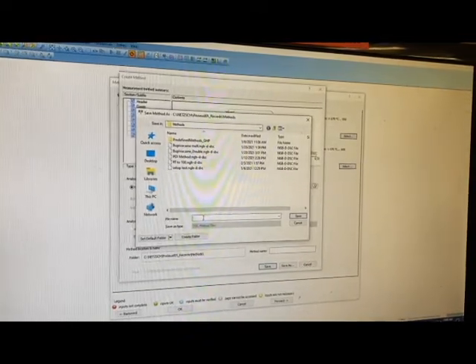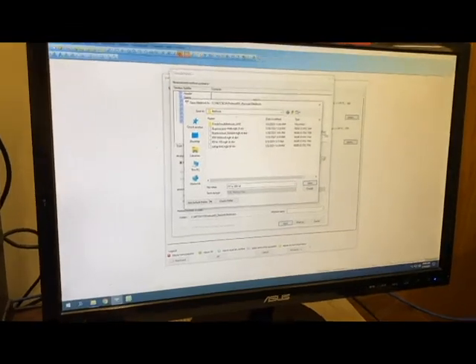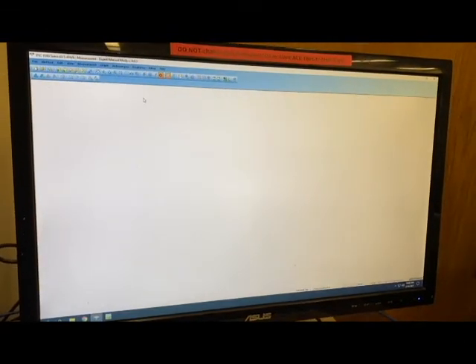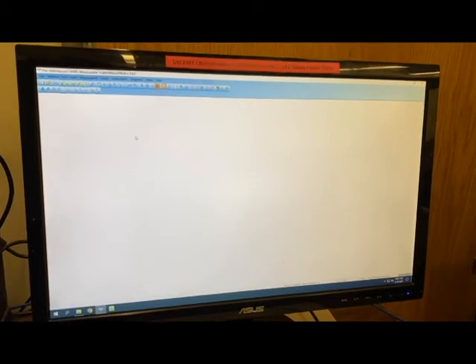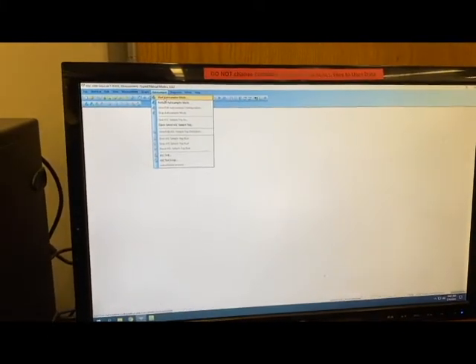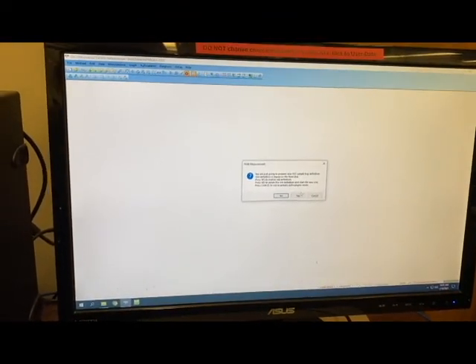We're going to give the method a name — I'm naming this 'RT to 200 with 15 minute hold,' just as generic as I can. You can save it by batch name or whatever is most useful to your project. Once the method is set up, click on Auto Sampler in the top menu and Start Auto Sampler Mode. That's going to ask if you want to load the last auto sampler setup — because you are not the same last client, we're going to start a new definition. Click No, then click Start.